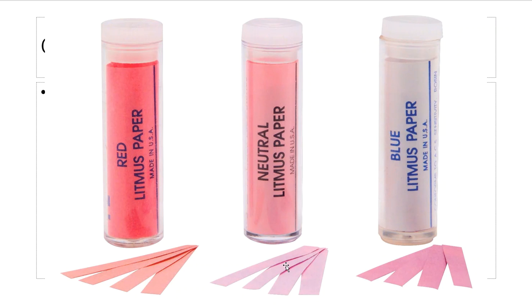And I know it doesn't look green in the picture, but a drop of solution onto this paper, if that drop turns red, it's acidic. If that drop turns blue, it's basic. So this is a very quick go-to, almost like a universal sheet of paper.